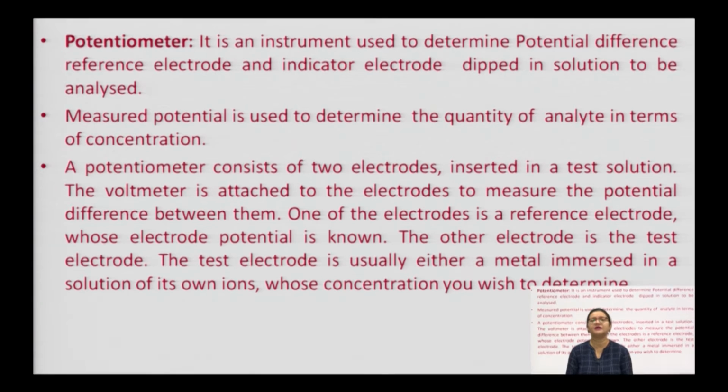It can be a glass electrode also, and it is dipped into the solution of the analyte whose concentration is to be determined.